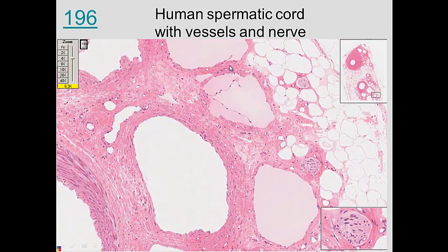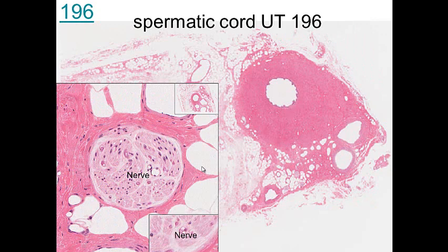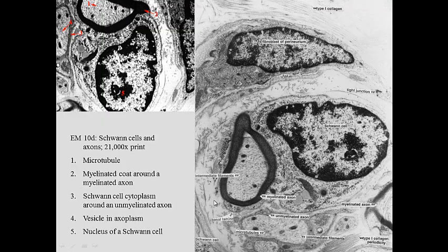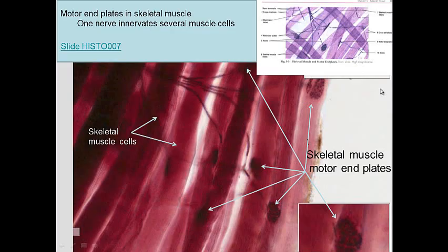If we look at the vessels in the spermatic cord, these are larger vessels — arteries or veins. We can see a circular structure here with myelinated axons on the inside and the perineurium — connective tissue — on the outside. Each one of these would be a myelinated axon. If we look at one of those axons, you can see the myelin sheath around that axon produced by this one Schwann cell. Outside of that is the perineurium, and interestingly the perineurium fibroblast cells make tight junctions between adjacent cells, which helps maintain the blood-peripheral nerve barrier.